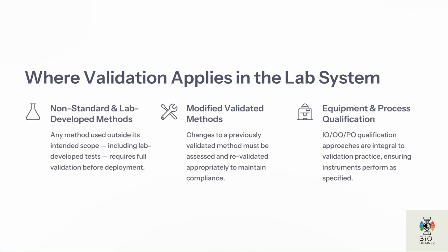Validation is not limited to analytical methods alone. It applies across many areas of laboratory operations. First, non-standard and laboratory developed methods require full validation before implementation. Second, modified validated methods must be reassessed whenever significant changes occur. For example, changing reagents, instruments, software, or sample preparation procedures may require revalidation.